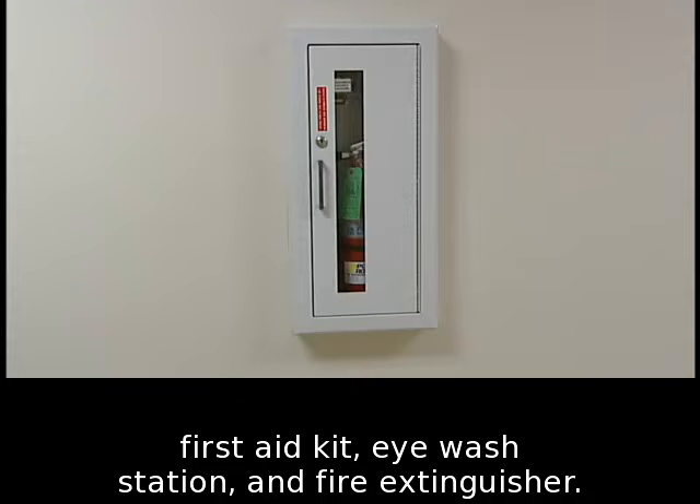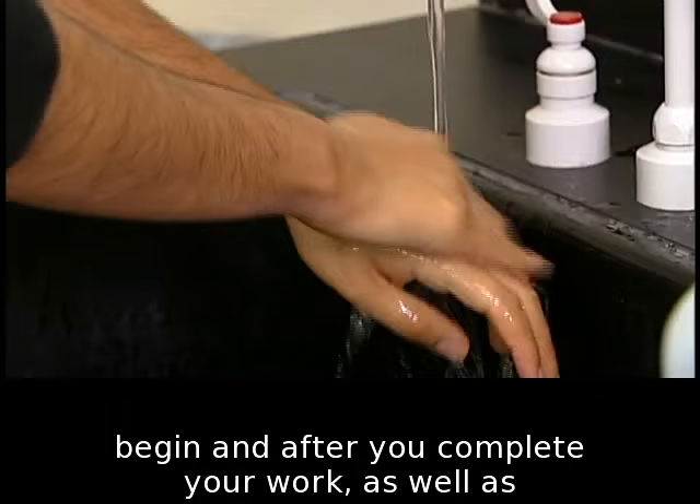Wash your hands with soap and water before you begin and after you complete your work, as well as before you leave the lab for any reason. Wash for at least 20 seconds.